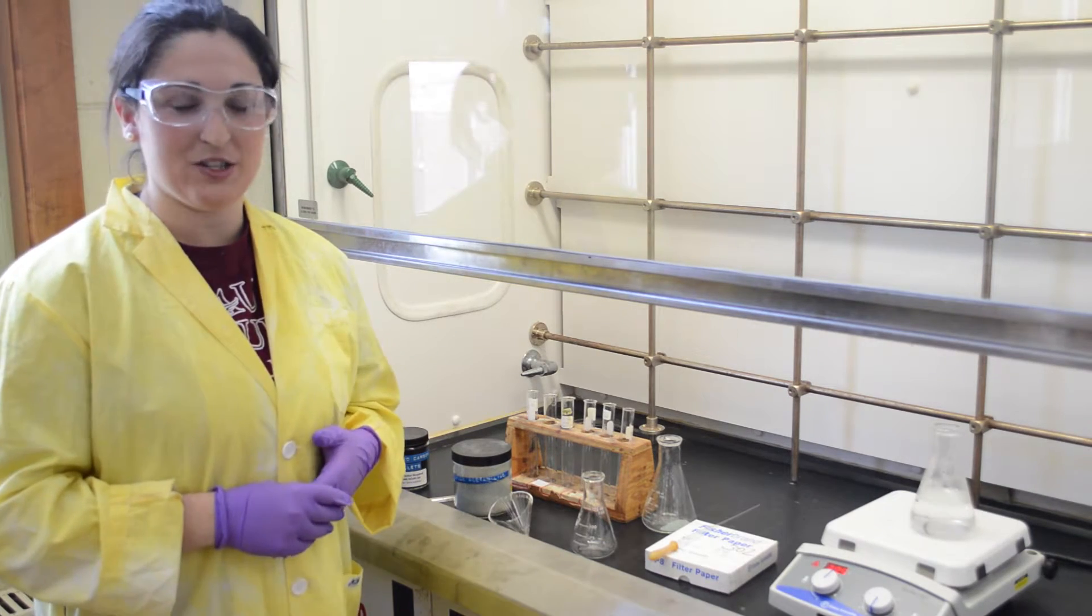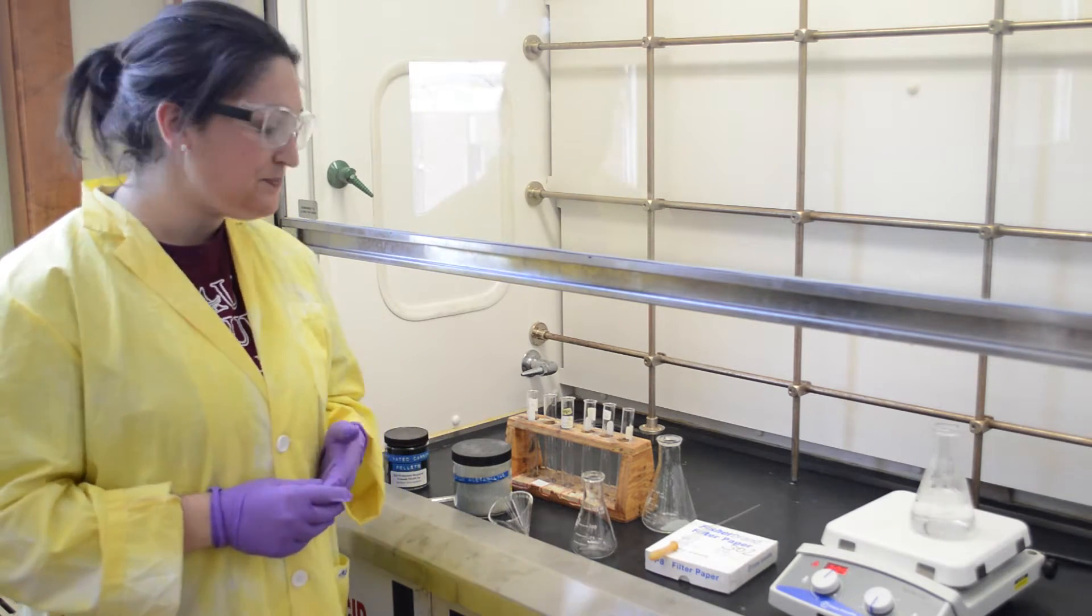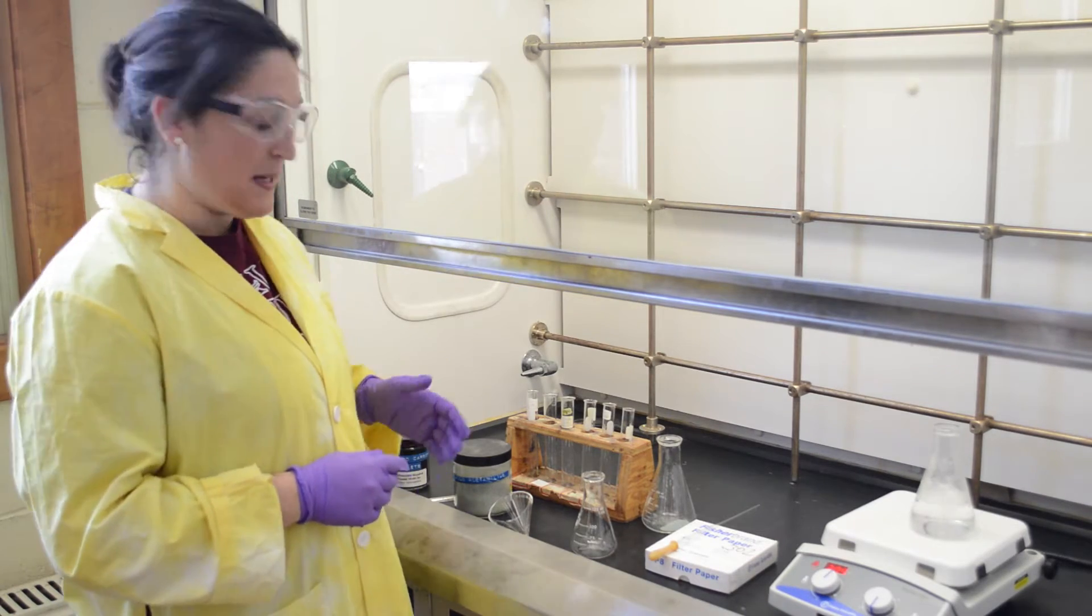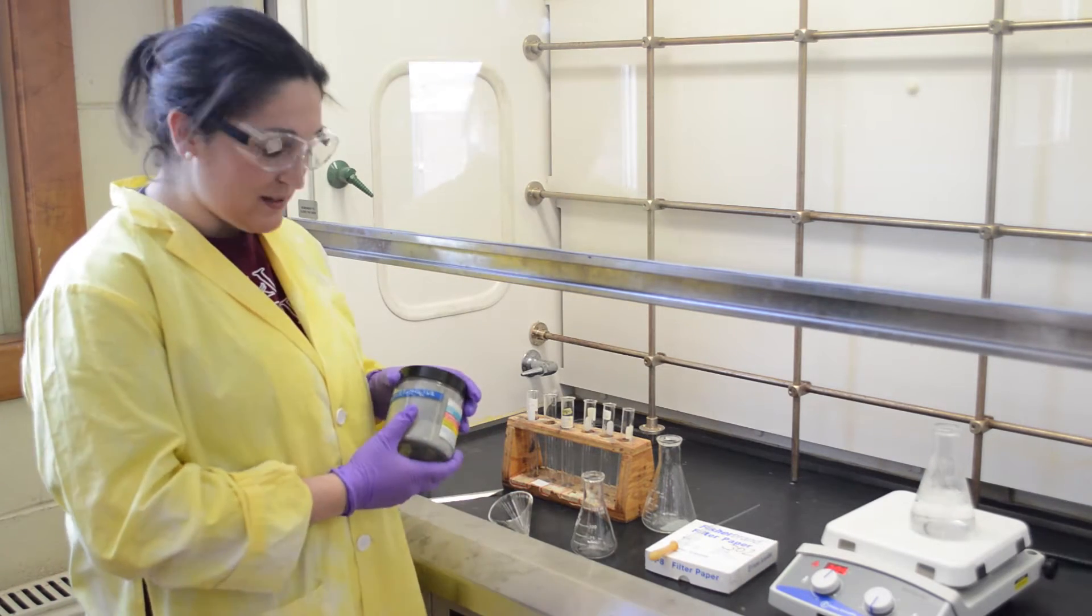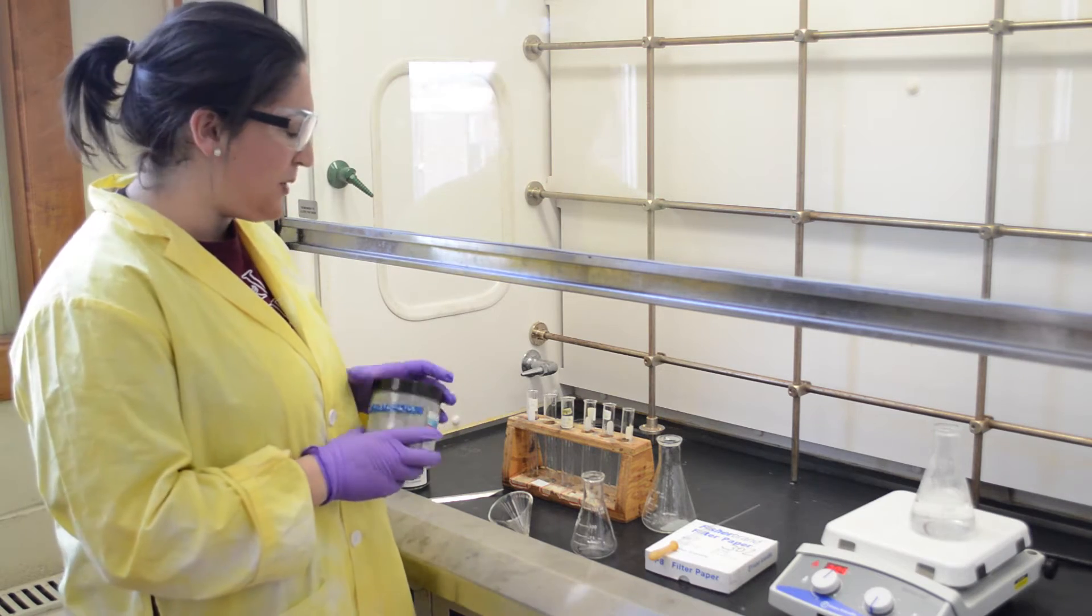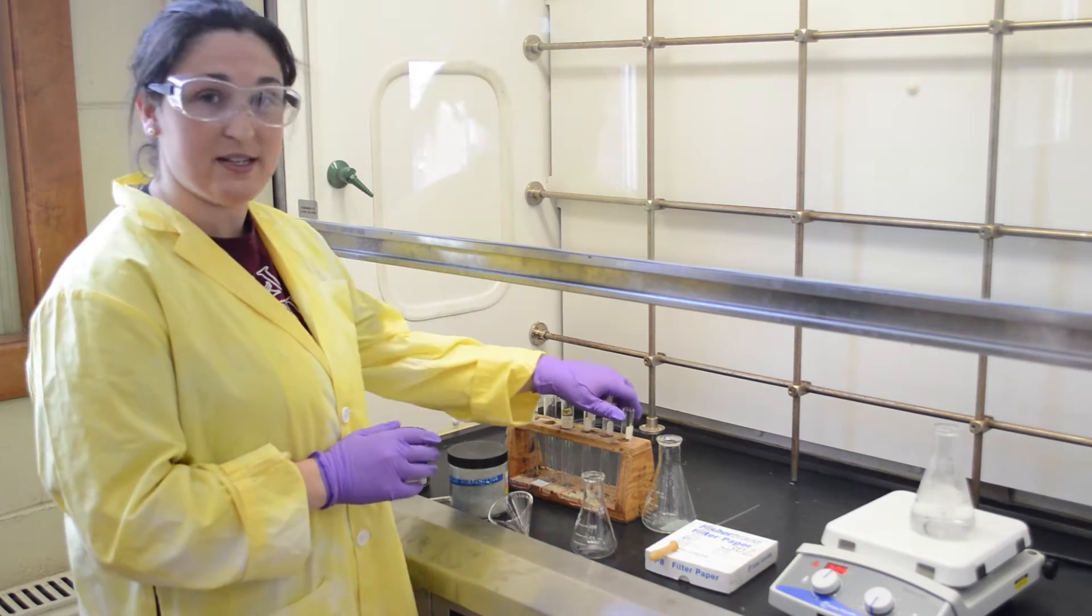The first step to recrystallization is determining the appropriate solvent. To do this, obtain a small amount of the crude product, which is the impure product, and put equal amounts of it into the desired test tubes.